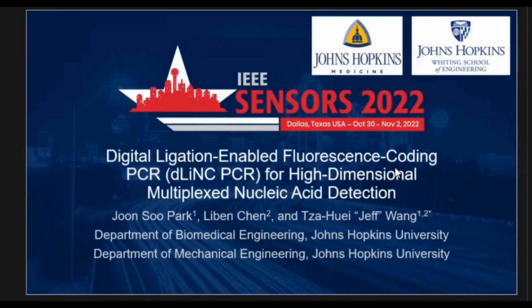My talk. My name is Joon. I'm a PhD student in Professor Wang's lab at Hopkins. Today, I would like to talk about digital ligation-enabled fluorescence-coding PCR for high-dimensional multiplex nucleic acid detection.